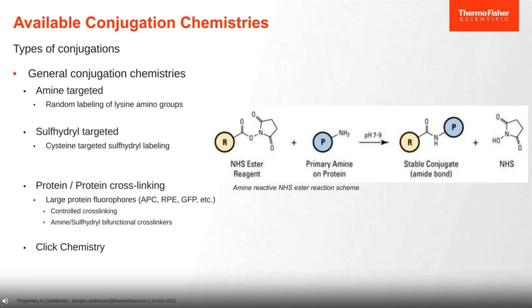This is probably one of the newest ones that we have on the market, and I've actually got a couple of slides dedicated to some of the recent advancements in click chemistry. So I'll step through these four categories in brief and highlight what the reactions look like and what the reactive groups are before we move on to the pros and cons.